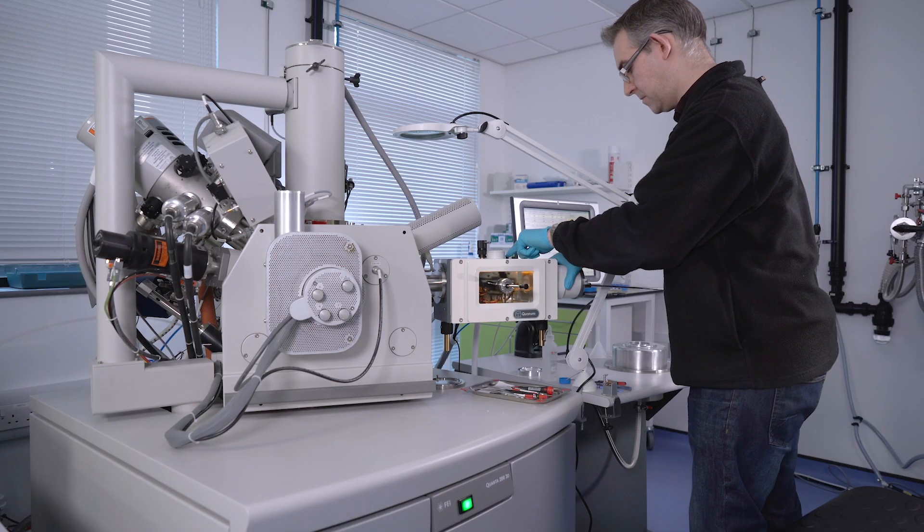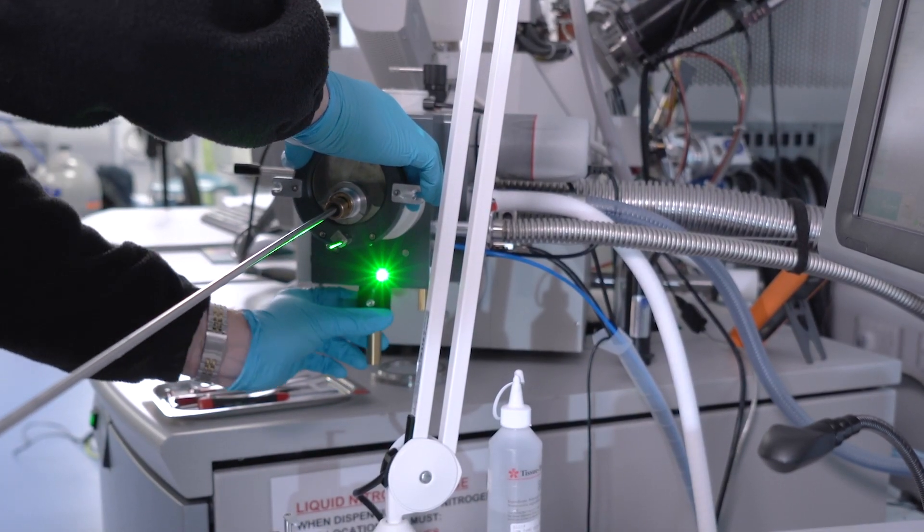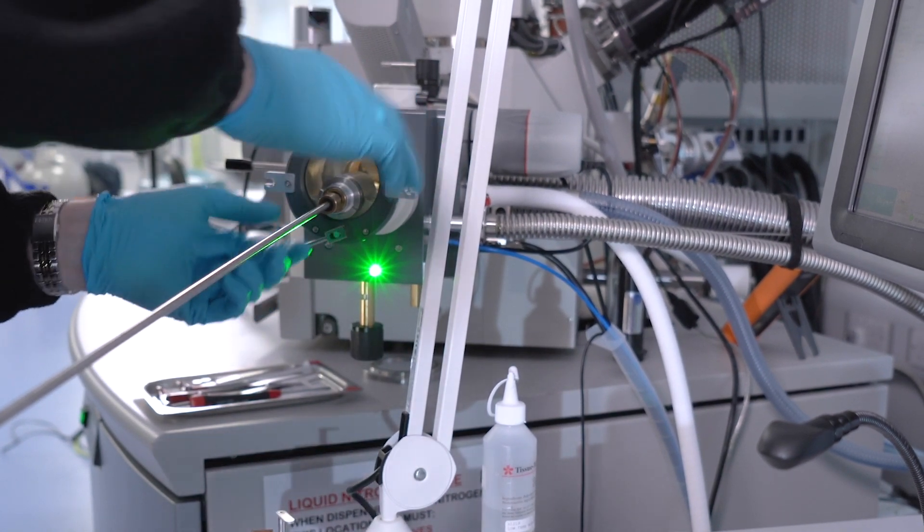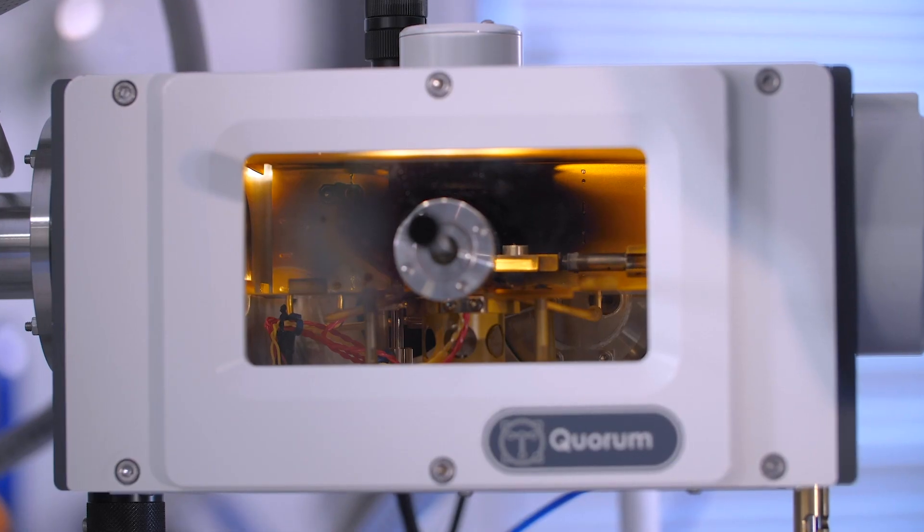So once the transfer pot is attached to the preparation chamber, we pump out the airlock, and once that reaches the right vacuum, it then allows us to open the valve and we slide the specimen in onto the cold stage in the preparation chamber.